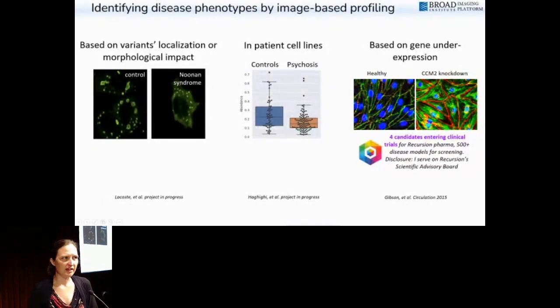You might think we stain for 6 things. Of course, drugs that are known to impact those 6 things, we're going to find those, but do you get other things? In general, we found that roughly 70% of FDA approved drugs impact one or more of the channels in the assay. So it's definitely catching a lot more than just the narrow things that you feel like it should be able to capture, which is more a limitation of our understanding of cell biology and how these drugs impact it than anything else. But it does capture a lot of broad things, which I think is what it's asking. I'm not sure I caught the meaning of the rest though.